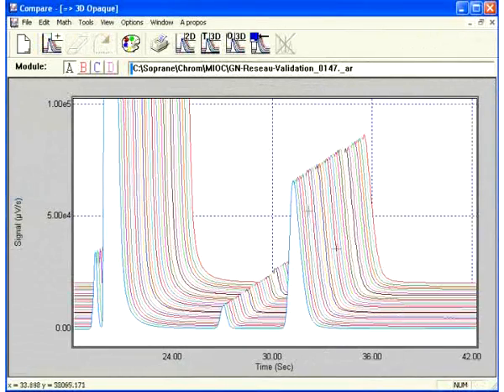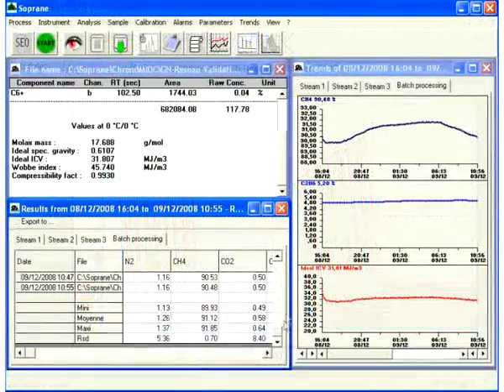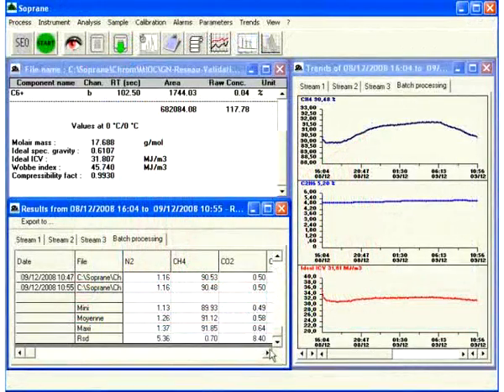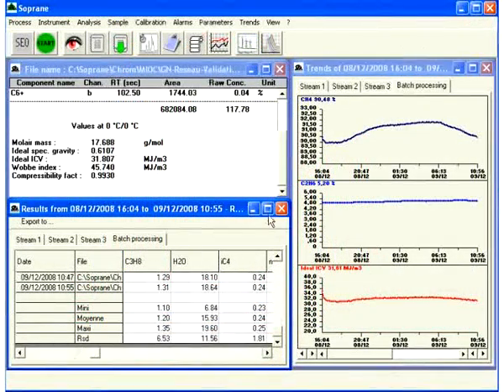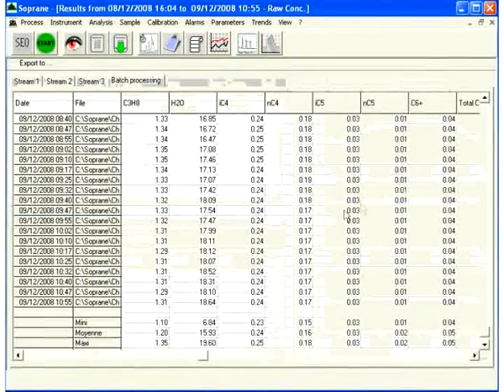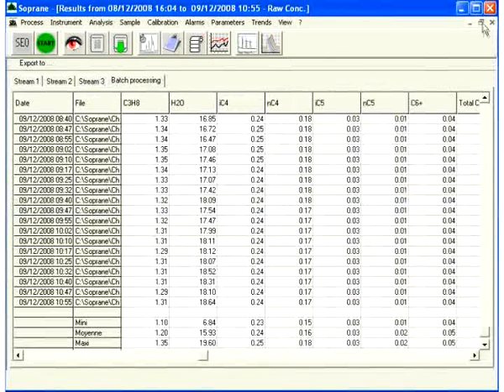Presentation of results in triple format: detailed report, spreadsheet statistics and graphical representation of trends.